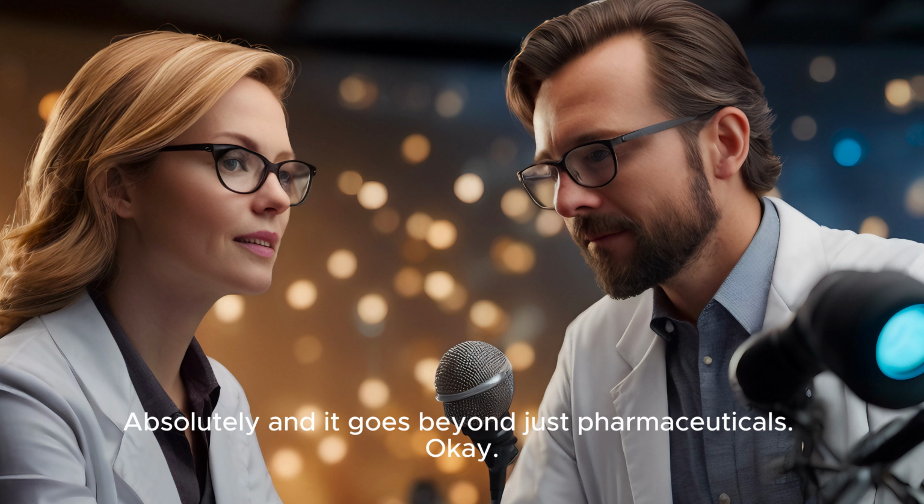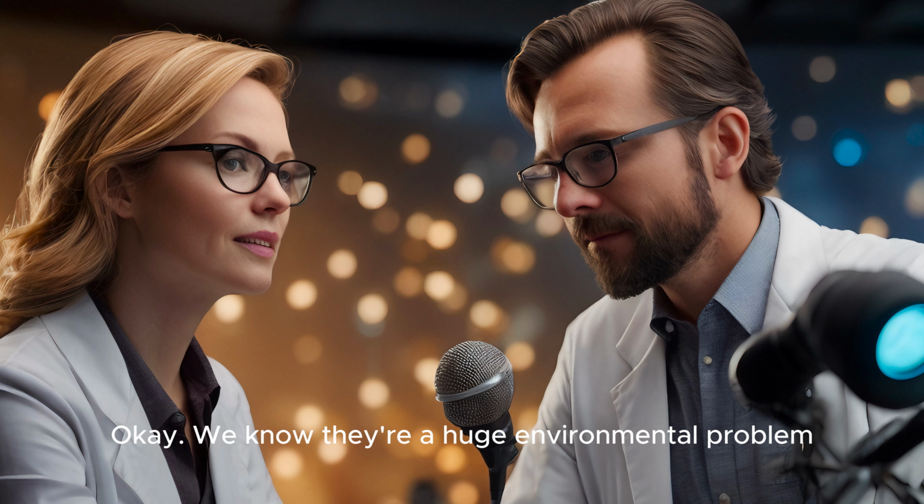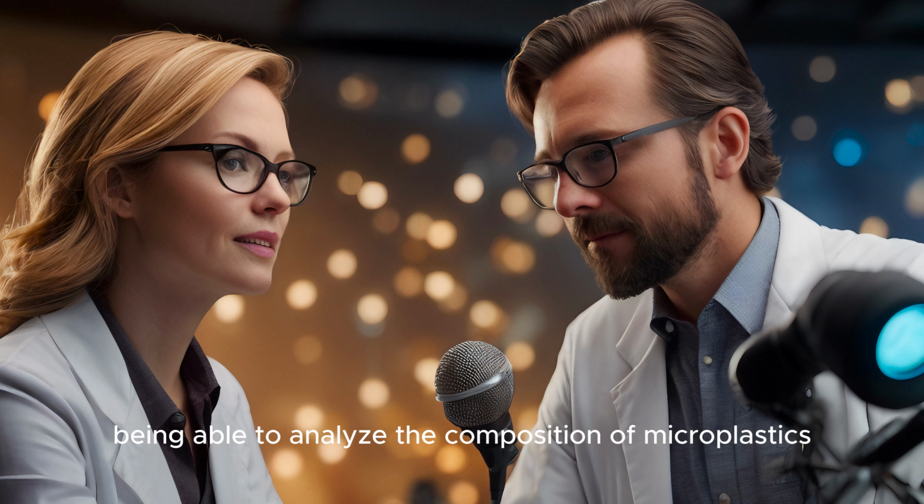Absolutely. And it goes beyond just pharmaceuticals. Think about microplastics. We know they're a huge environmental problem, but different types of plastics break down differently. Being able to analyze the composition of microplastics, maybe even at the isomer level, could help us understand how they're impacting the environment and develop better ways to deal with them.